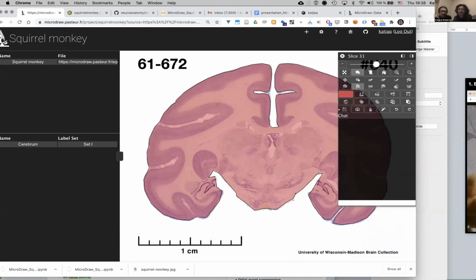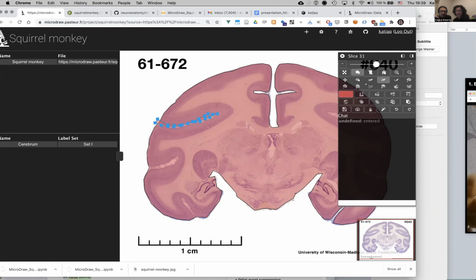So we have here the cingulate is segmented, but then here the lateral sulci are not segmented. We can now draw another region on top of them and subtract. So what I've done before can work the same way here. You can have a two-step approach. You could first draw the cerebral envelope and check what your volume and surface area give you. And then in a second step, you erase the sulci and do the surface and area computation again. And you see how good your approximation would have been based on methods where you would just start from an envelope.